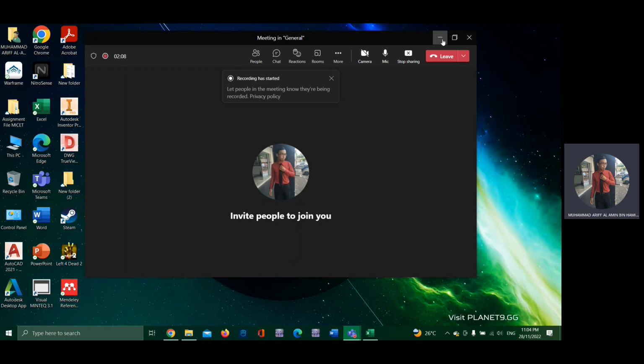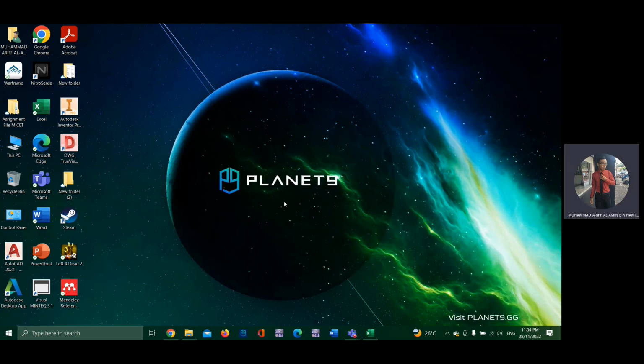Hi, my name is Muhammad Arif Al-Amin bin Hamidi, and today I will be simulating Visual Minteq. So first of all, we need to run the Visual Minteq.